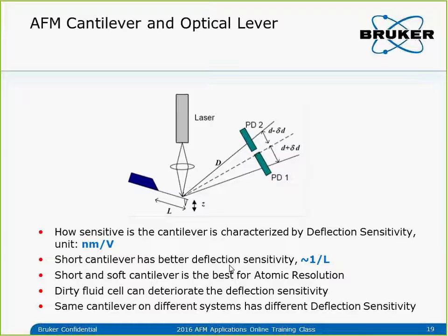For fluid imaging, deflection sensitivity is also affected by how clean the fluid cell is. If there's a lot of dirt on the fluid cell's glass window, the refracted laser will disperse and the laser spot on the photodetector will be larger, making it less sensitive. So deflection sensitivity is also related to fluid cell cleanliness — make sure the fluid cell is clean. Also, even the same cantilever on different AFM systems will have different sensitivity because the optical path is different.